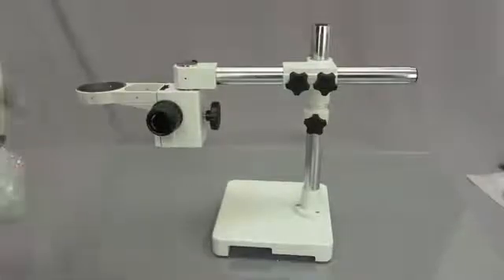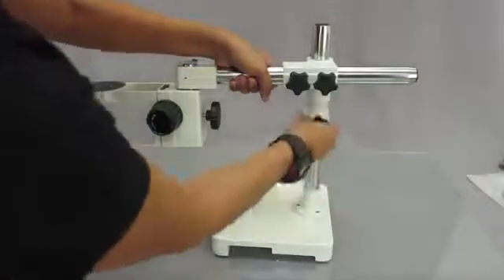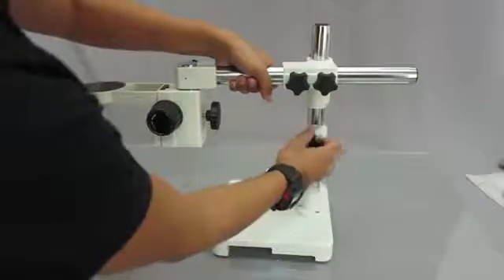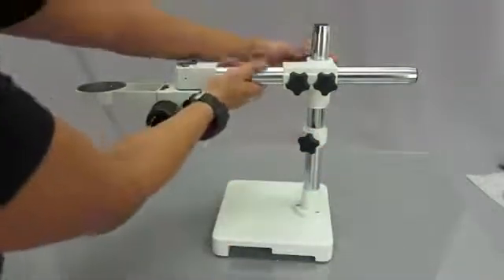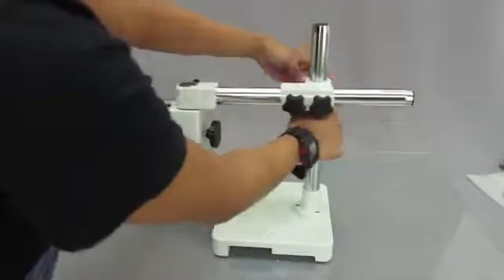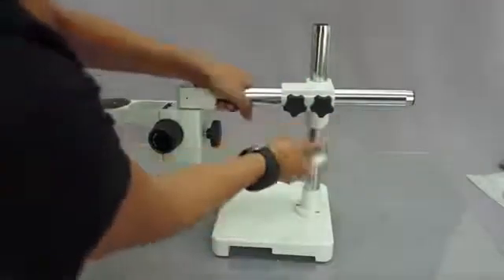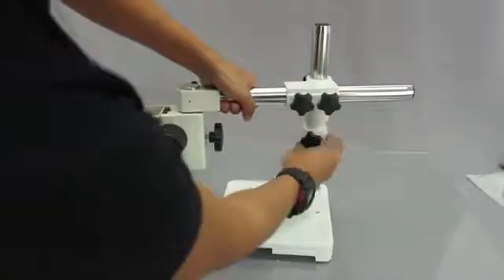Now if you wanted to move the microscope up or down, all you have to do is unscrew this part and then screw it into a place that you need it. So let's say that I want it placed right here. After I do that, I'm going to unscrew the other screw in the back here, this knob right here, and I'm going to turn it down. That's how you would move the stand up and down, just by controlling the knobs. Unscrew that, up and down. To lock it in place, just screw this in.